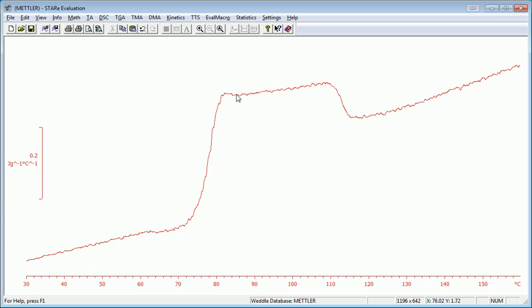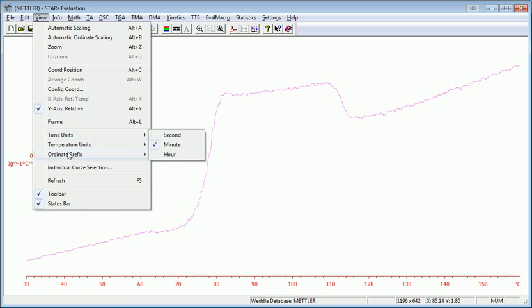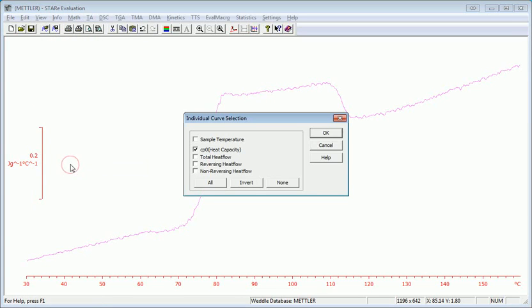Let's show the reversing and non-reversing and total heat flow. If you select that curve and you hit view individual curve selection, the other signals I have available to me are sample temperature, total heat flow, reversing heat flow, and non-reversing heat flow.